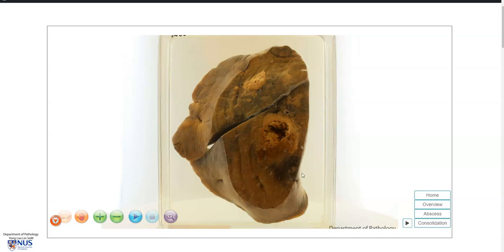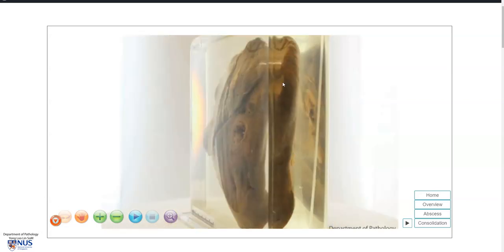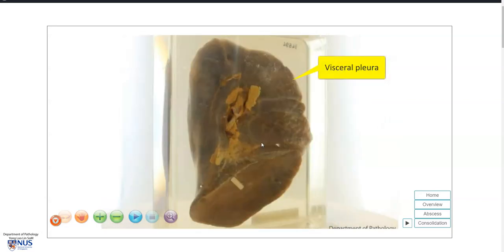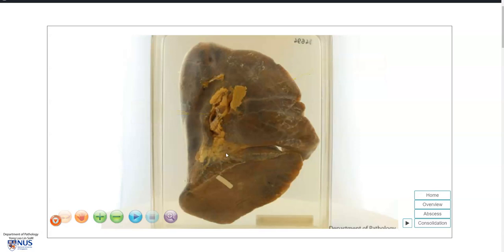Hello, this is a virtual pathology specimen showing a slice of the lung with the upper lobe and the lower lobe. We're looking at the cut surface, and turning this specimen around, we can see the visceral pleura and here is the hilum of the lung.